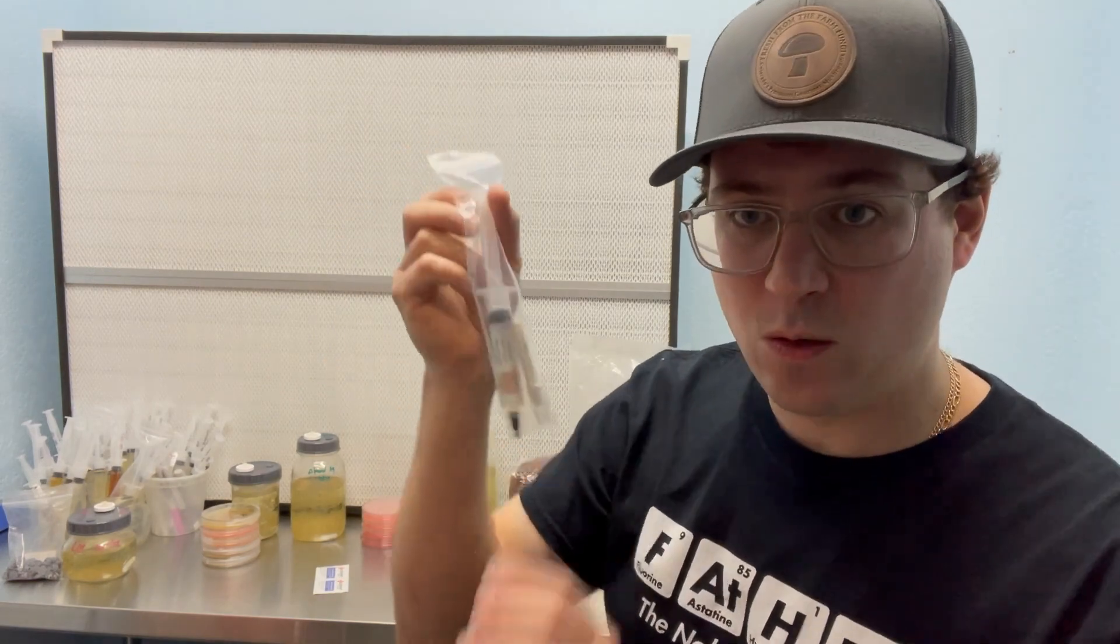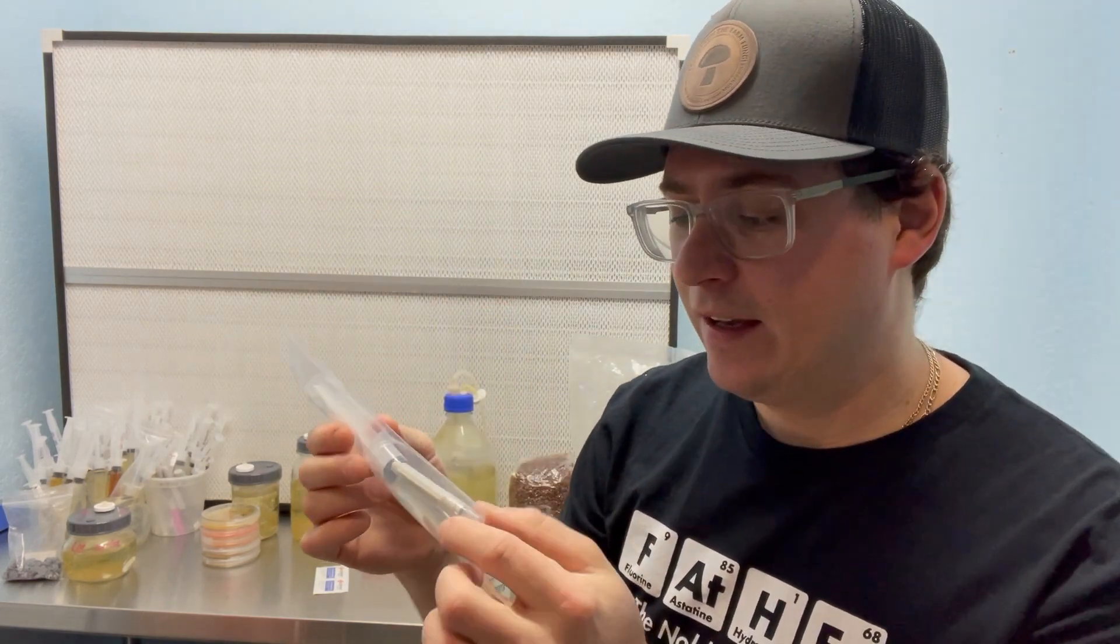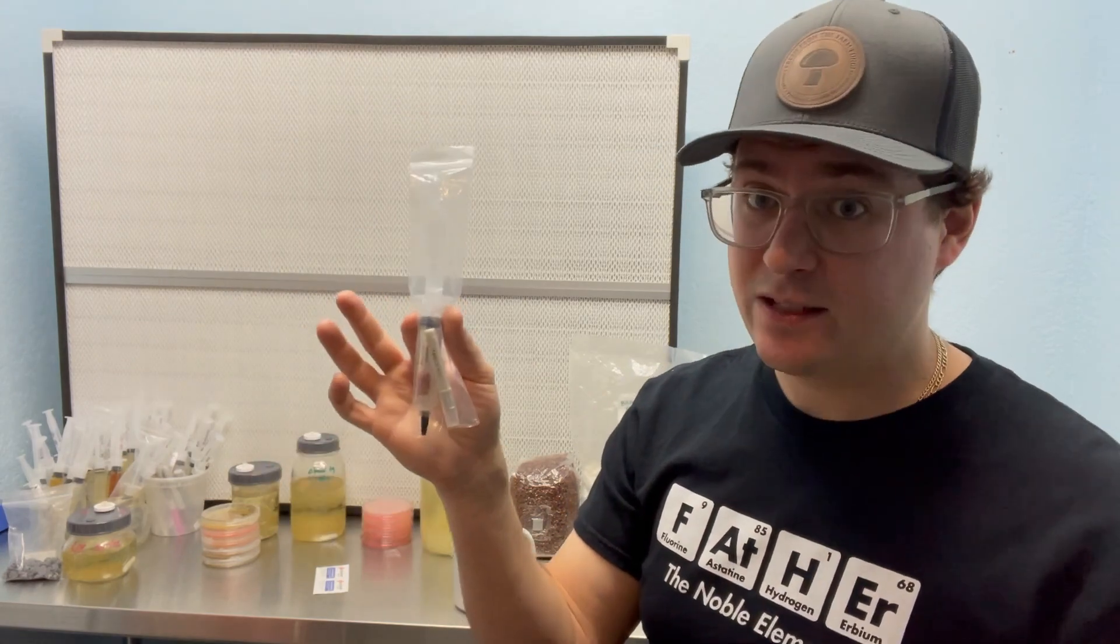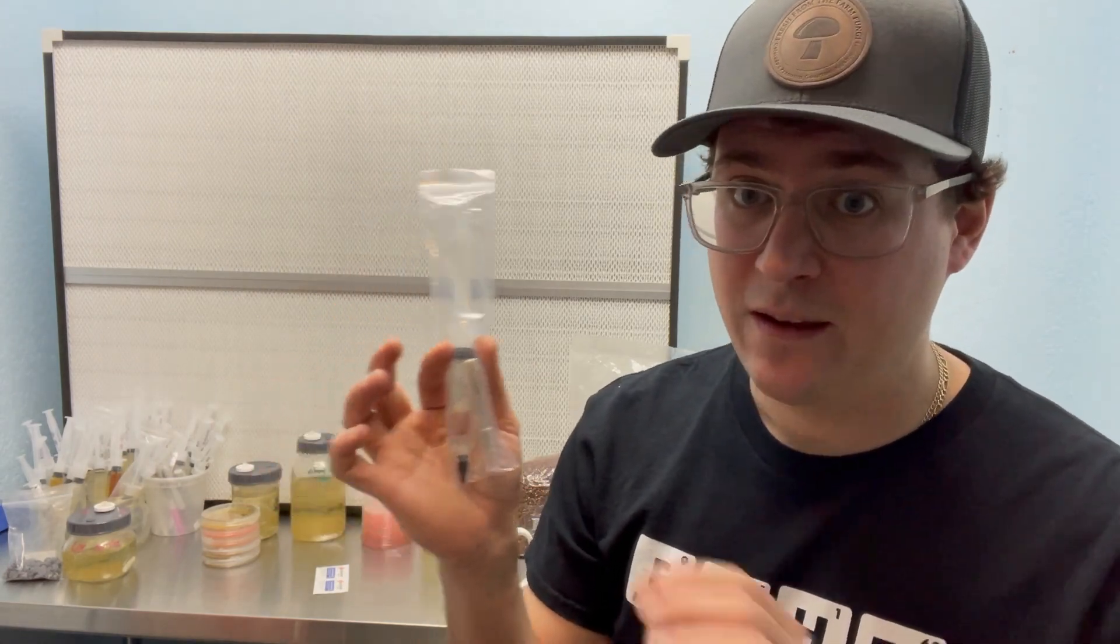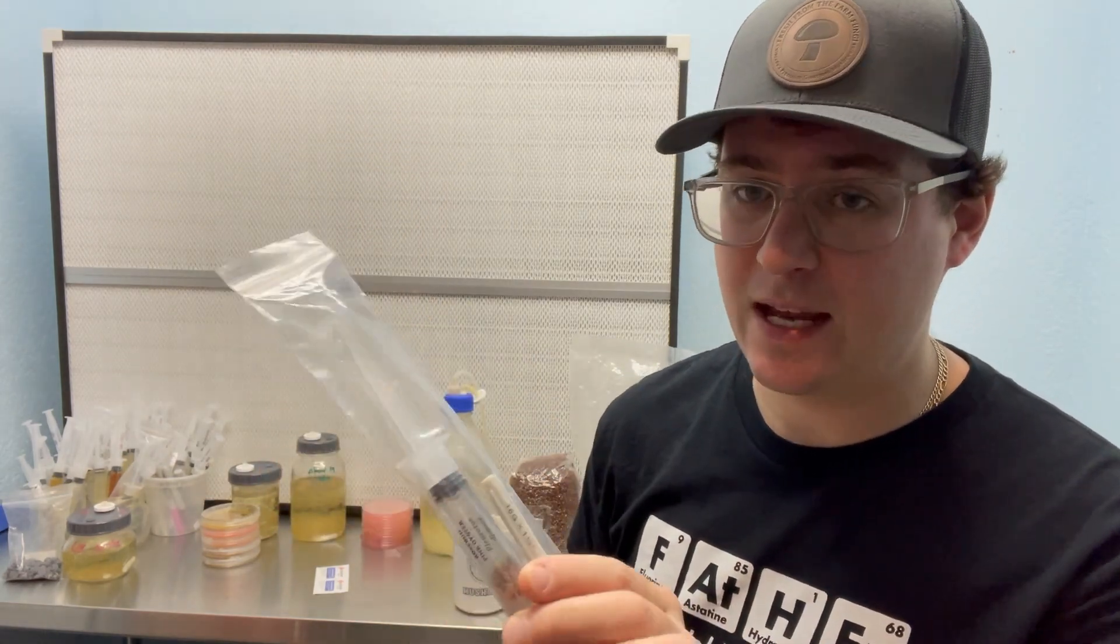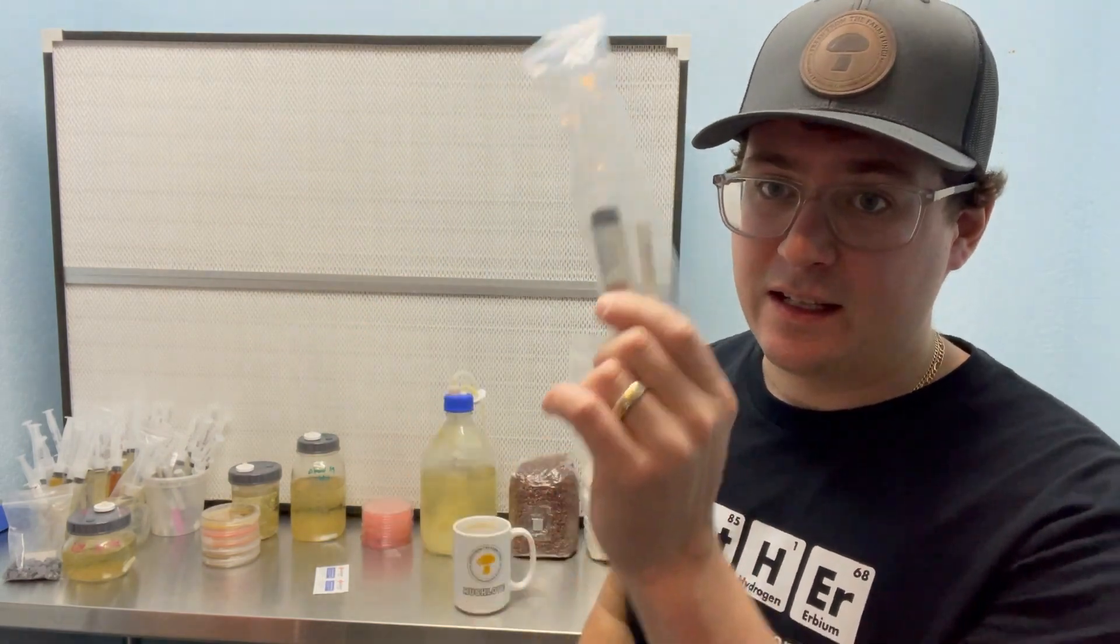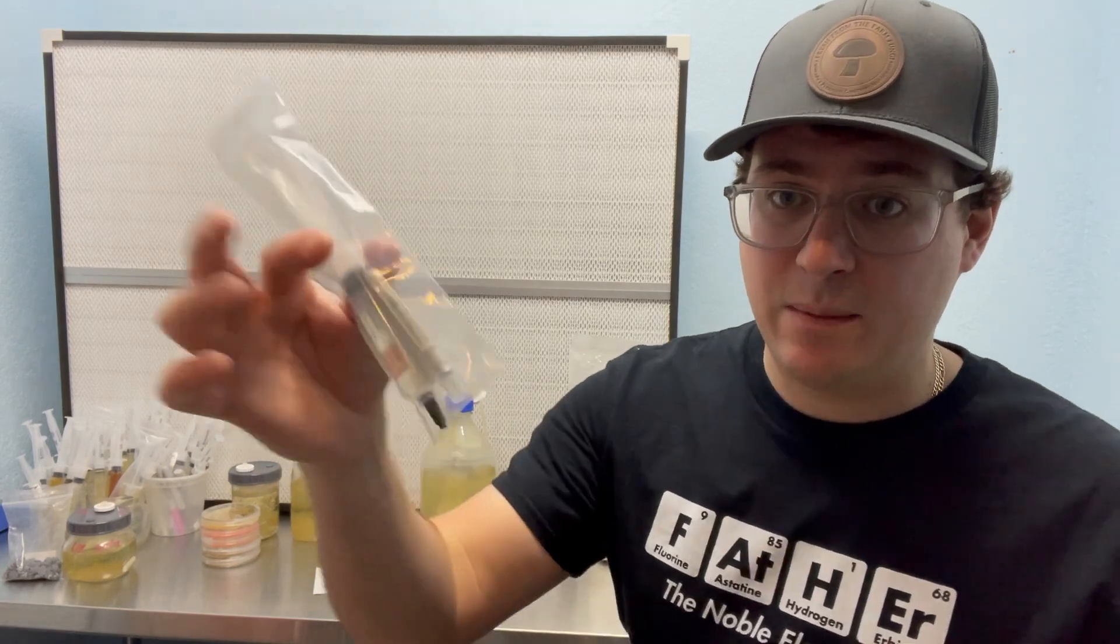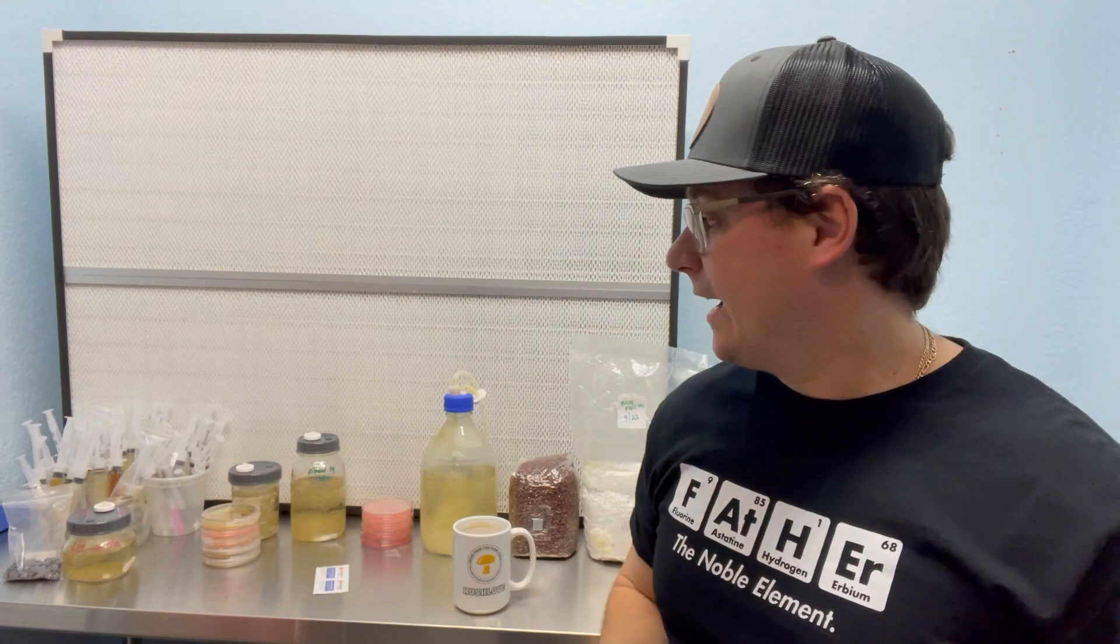Some of the questions that I get a lot are how much mycelium needs to be in this liquid culture to have a successful grow. The answer is that there only has to be one viable cell. Sometimes you might get liquid cultures like with lion's mane where it's very sparse and faint, but as long as you follow these processes correctly, you should be able to expand that liquid culture pretty quickly and then you can continue on with your cultivation.